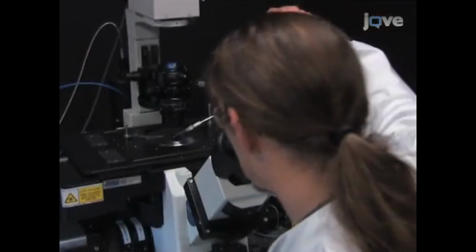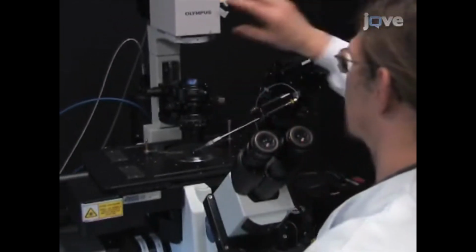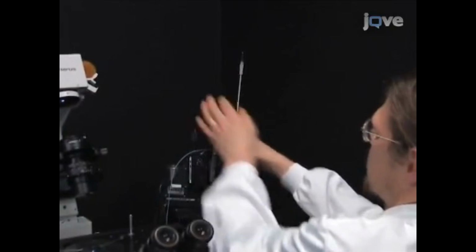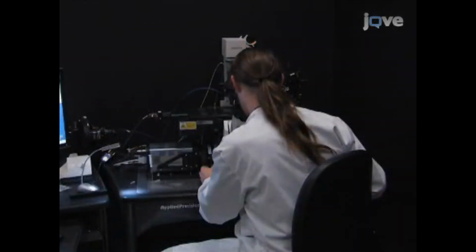When all the oocytes have been injected, manually move the needle out of the oil and orient it out of the beam path for the microscope. Make sure that it is in a safe orientation to avoid eye damage. Lights are turned off to facilitate fluorescence imaging.